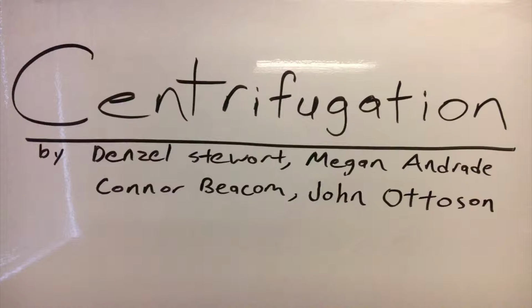Centrifugation by Denzel Stewart, Megan Andrade, Connor Beacom, and John Otteson.